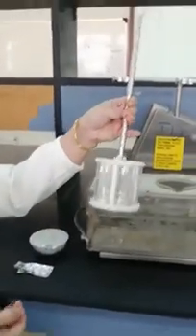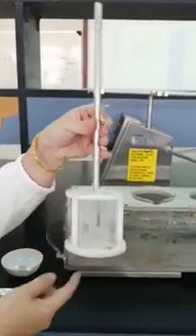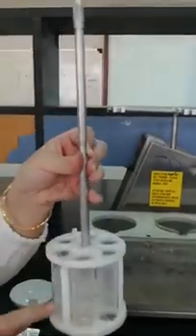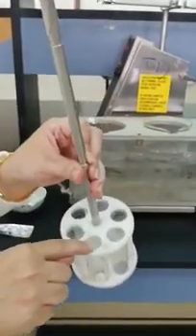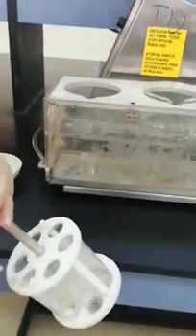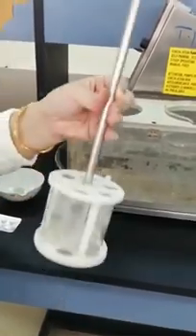The fourth official test is disintegration. We do it using a vessel composed of 6 cylinders, and it is ended by a sieve or mesh. In each cylinder we put a tablet and cover it with a transparent cover, which enables us to see if the tablets get down in the water. This is the 6th tablet.